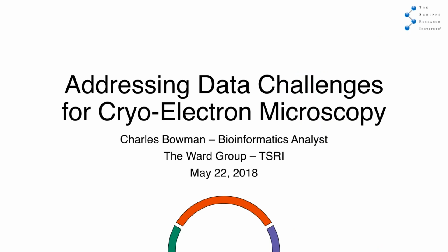Thanks, Corey, for the introduction and for giving me a chance to speak. As Corey said, my name's Charlie Bowman. I am a Bioinformatics Analyst in the Ward Group at TSRI, where I work with Andrew to keep our cryo-EM facility running and have a few other things going on. I'm here to talk to you about data challenges for cryo-electron microscopy. I'm going to provide some benchmarks and some advice based on the success of our facility here.